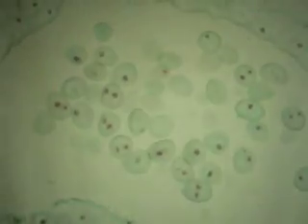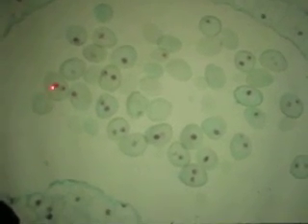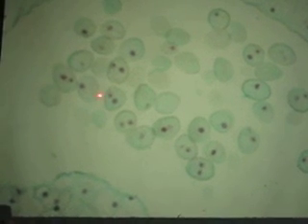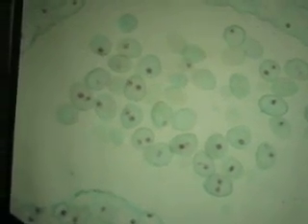All right, now our first slide actually is number 8. This is a flower bud of lily. Here you can see the trilobed style and the anther sacs. These are sepals and petals. They all look like leaves, but they are. But look in the anther sacs under 10X, and you can see the pollen grains with how many? 2 nuclei. A generative nucleus and a tube nucleus. The generative nucleus will make 2 sperm after pollination. Now, the next 3 are a unit.